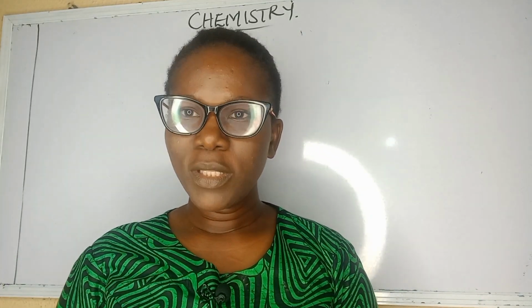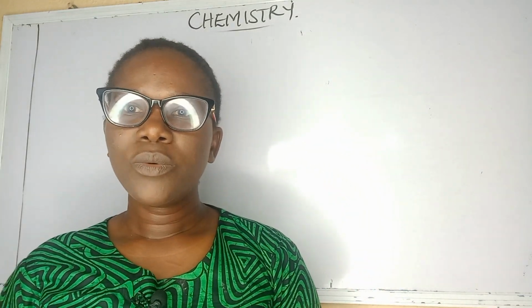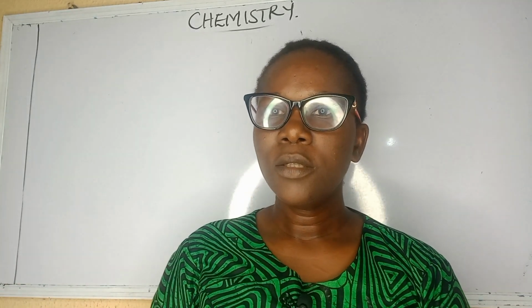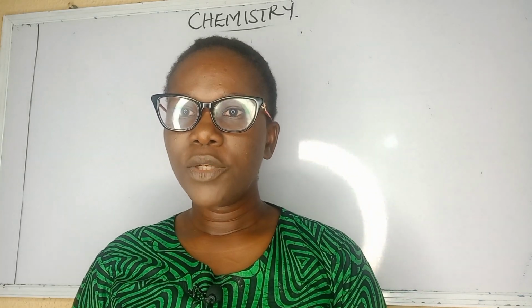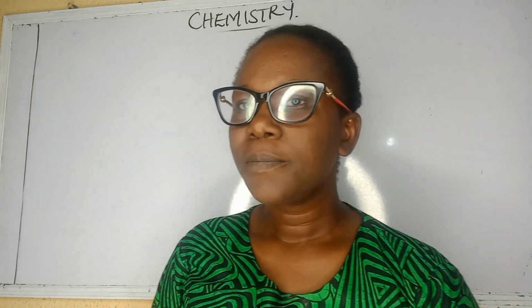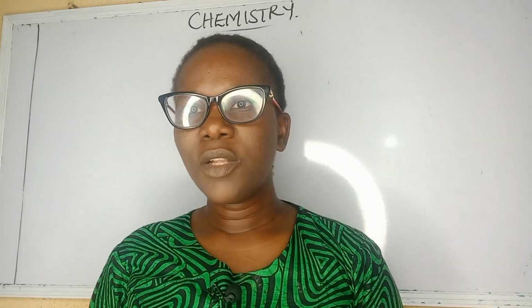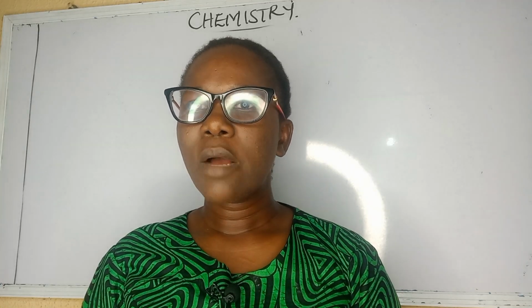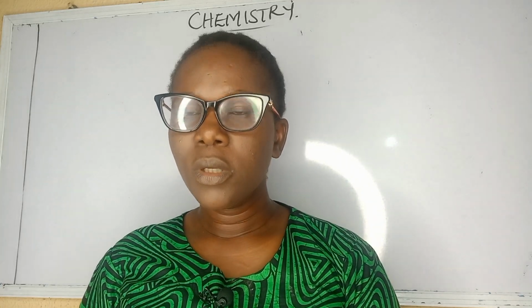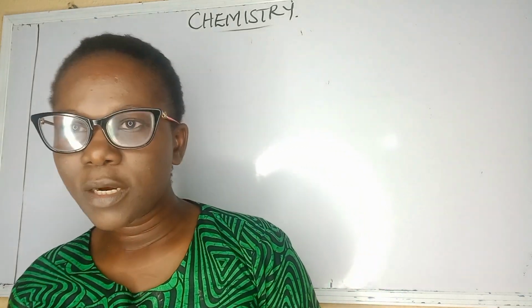Quickly, I want to treat a very important aspect in chemistry practical. This will really help you concerning your WAEC examination and other examinations under qualitative analysis. Now, you are going to be given three aspects, three questions in chemistry practical. The first question is on calculation, which is titration. The second part is qualitative analysis, while the third part is a general question.